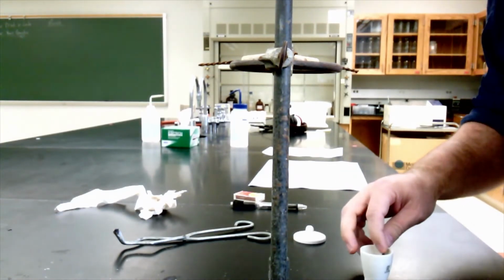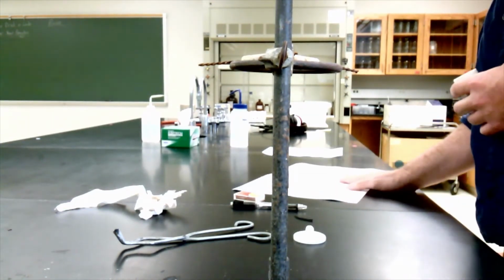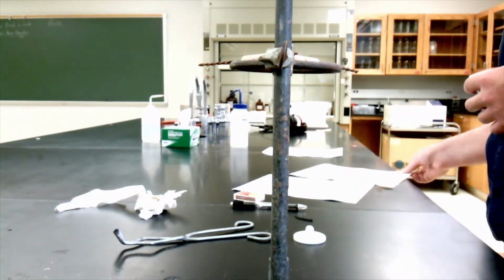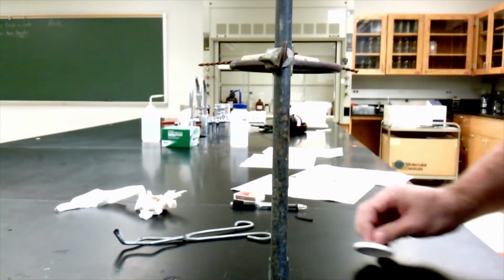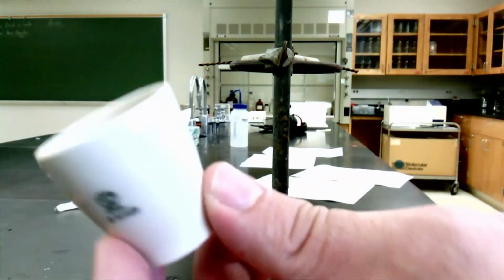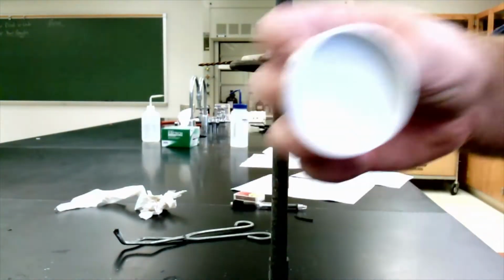But now that I have all my stuff ready to go for procedure B, let's talk about it a little bit. Okay, so the first thing that we need to do is listed on the procedure in step 5. Okay, I need to get my crucible. So here's my crucible right here. Okay, it's just a little ceramic vessel that I'm going to heat my magnesium in. And it has this nice little lid that I'm going to put on top.